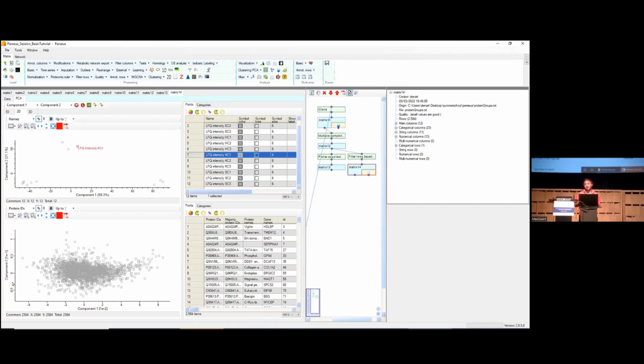In a very simple case, this axis right here will actually be the protein expression of one single protein. But normally it's the expression level of protein A plus the expression level of protein B plus the expression level of protein C. So it's a complicated function that makes your data more circular, let's say, in a way.